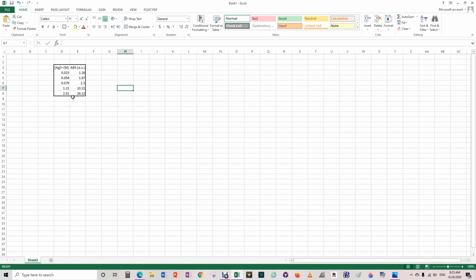This most likely will be somewhat related to Beer's law, and you have to use the slope to calculate the constant. In this case, it is the absorbance constant.